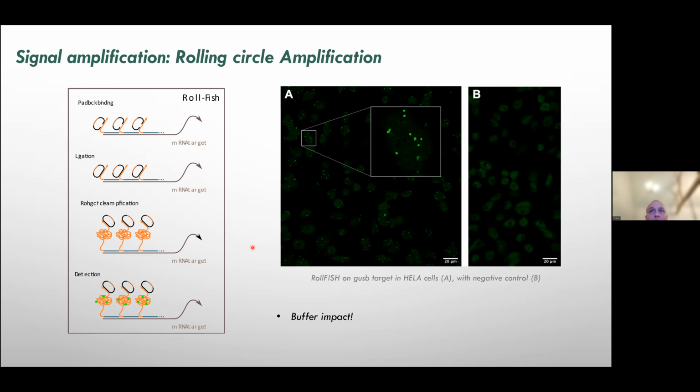And this means that you will probably need to have a secondary polymerization of your sample to get something that is stable enough to go through these hybridization steps. This is all somewhat optimized in some of the papers that we did, but also in recent work of the Boyden group, for example.